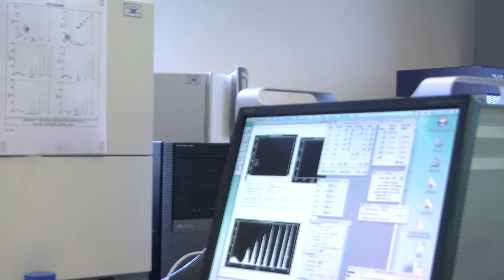Because if we run your sample through, and actually we get 100 cells coming through, because for whatever reason you've aspirated your sample or you've lysed it or something like that, the median is not going to be that informative because 100 cells isn't statistically significant. But we're going to run about 10,000 events from each tube. So you need to look at the number of cells there are, and the way I'll prepare your data is I'll show you the number of cells, and I will show you the amount of fluorescence on each as dot plots, like this one I had, the 2-colour dot plots. And I'll show you histograms for each of your markers with the median fluorescence.